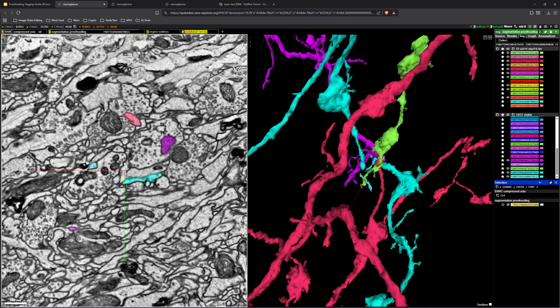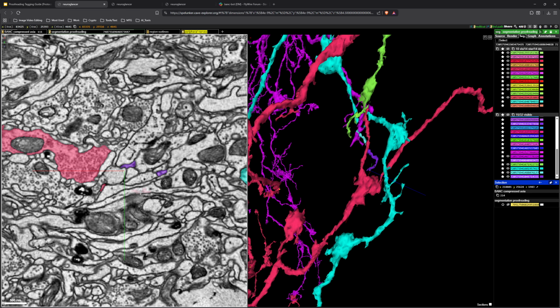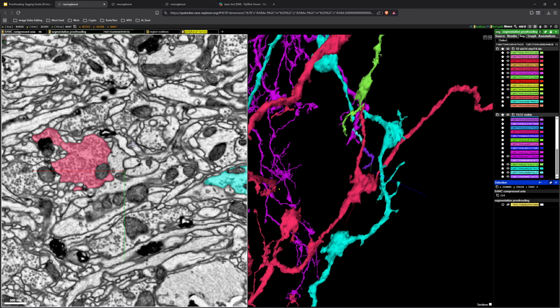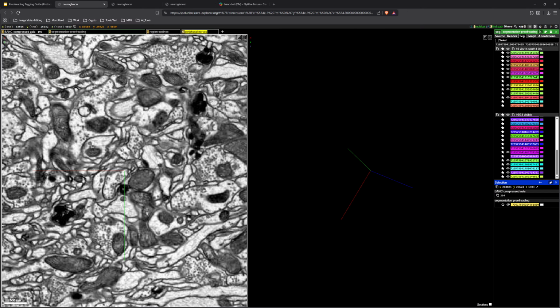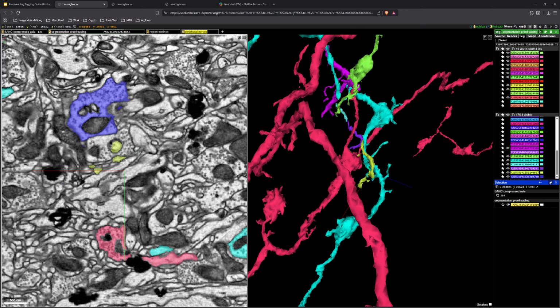And just tracing this normally, we can see that this is a smaller type of branch, which goes up, falsely curves that way, but we're not too concerned about that. And it seems to go into this axon, but I imagine it does not end there. Usually it ends in a bouton, like this.